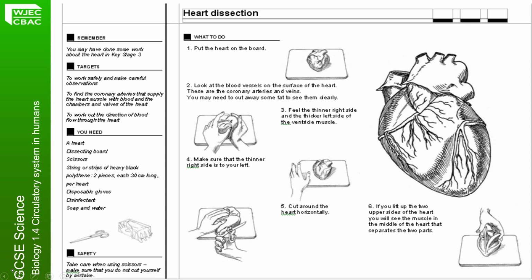If you are using a knife, please be very careful, and all incisions always need to be made away from you. If you can see in this diagram down here, they're cutting away from them. If you're using a knife or a sharp pair of scissors, cut away from you, never towards you.